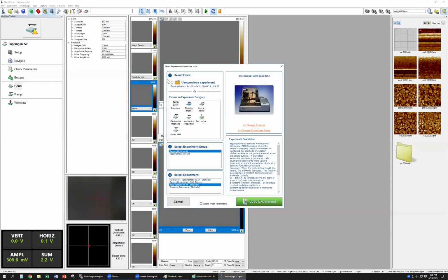So here, we go back to the basic one. For the force curve, we have two methods to get the force curve on this screen. The first one is a contact model. Okay. For example, I put one sample here.